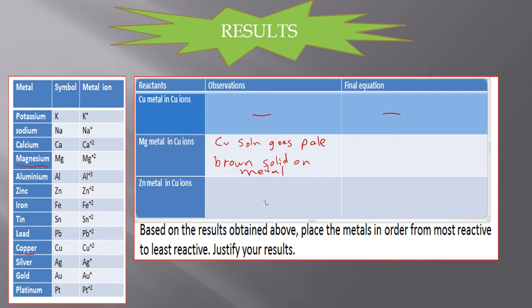In this one, you will see the same thing. Zinc is there a little bit lower on the reactivity series. Because the magnesium is higher, you would expect it to react quicker, a bit more vigorously. You would probably expect to see a little bit more of the solid copper formed, because it's going to react quicker, than you would with the zinc. Because the zinc is slightly lower on the reactivity series, hence slightly less reactive.